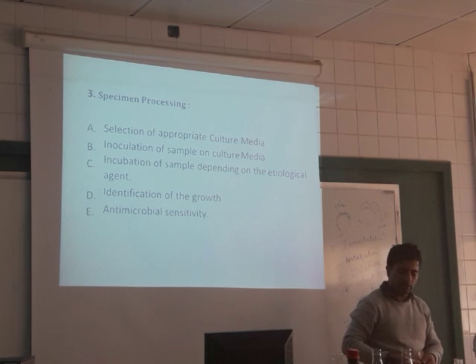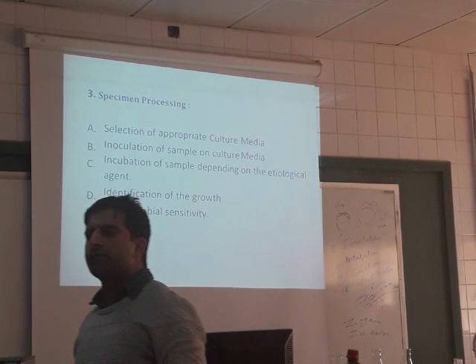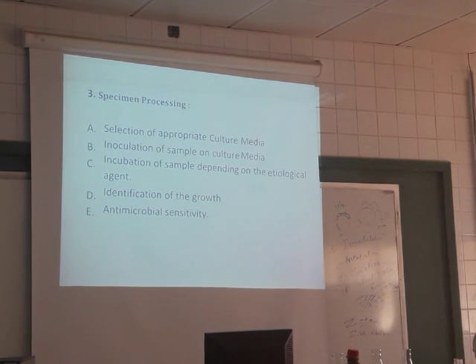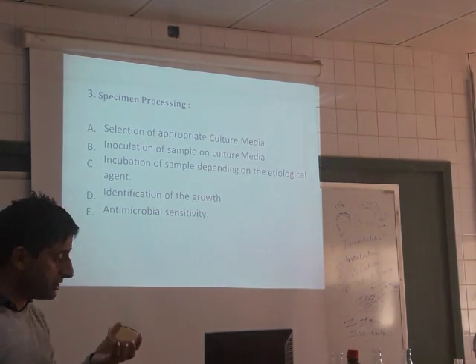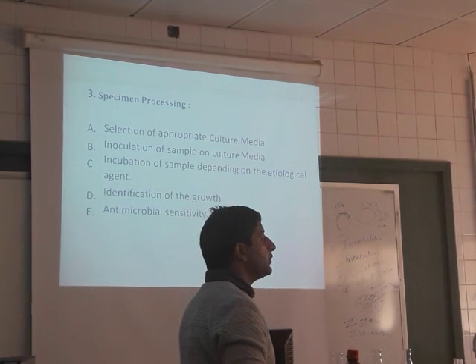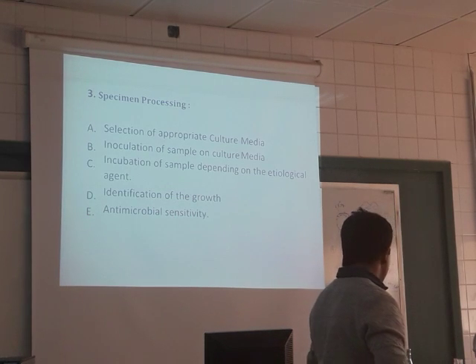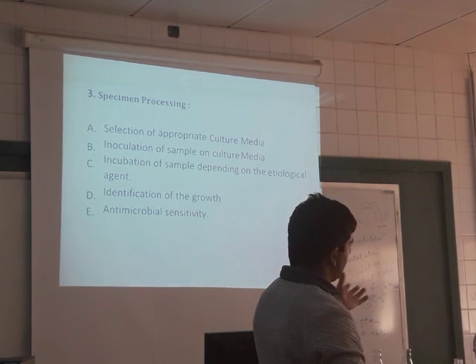You know what is isolation? First you do inoculation here, then you do the incubation. After 24 hours, as your friend asked earlier, how much time? After 24 hours, after 12 hours, it depends upon the microbe, maybe after 5 days, you take it out, then you see what's present here. Then you see the bacteria grown, it is called isolation. Then what you need is identification. Identification either you do by stains, or you can do by other ways.